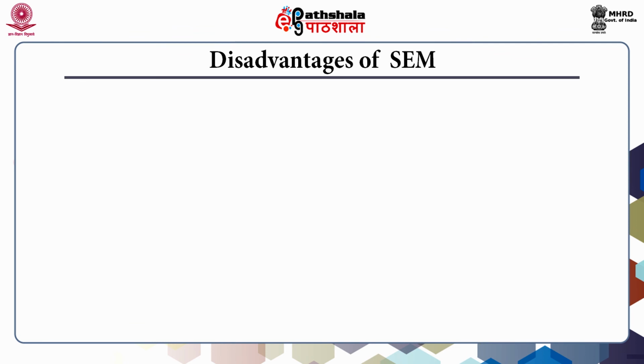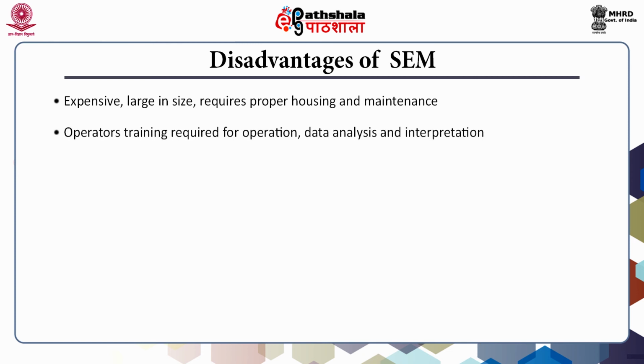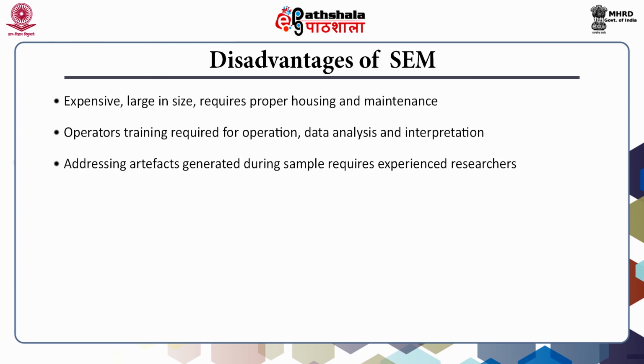There are several disadvantages of scanning electron microscopy. It is expensive, large in size, requires proper housing and maintenance. Operators are required to be specially trained for operation, data analysis and interpretation. Artifacts generated during sample preparation can be addressed only with the help of experienced researchers.